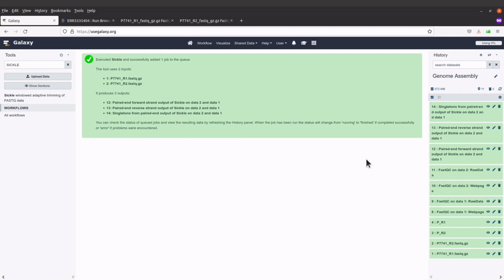So I'll first rename my files here because I usually have a naming convention. It helps me to track whatever I'm doing, and it helps me to organize my files. I'll rename both, but I'll use these two.